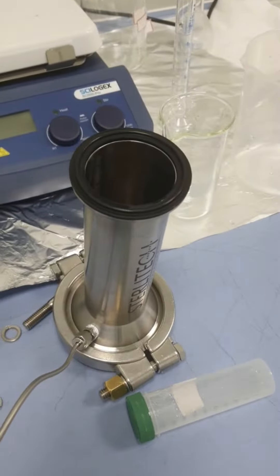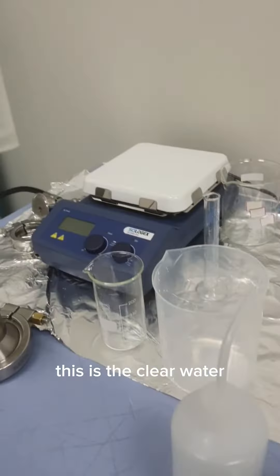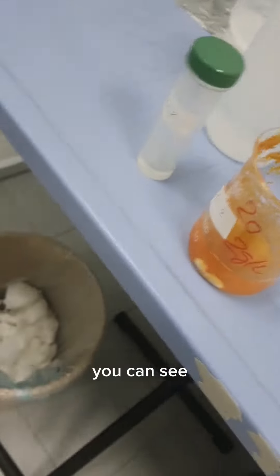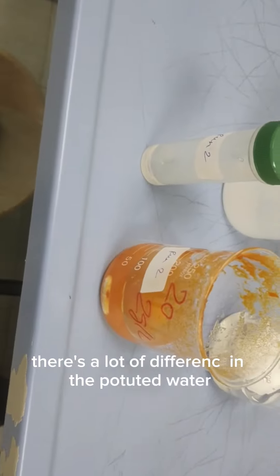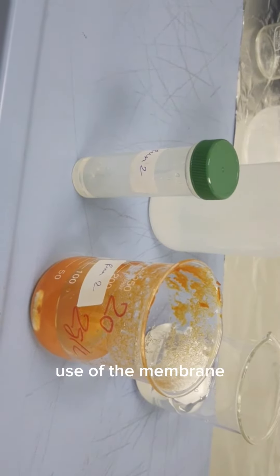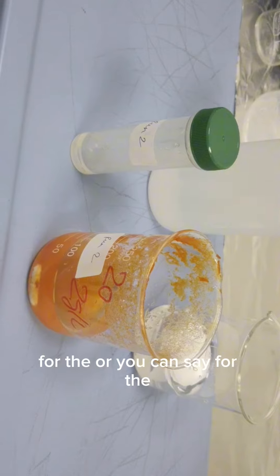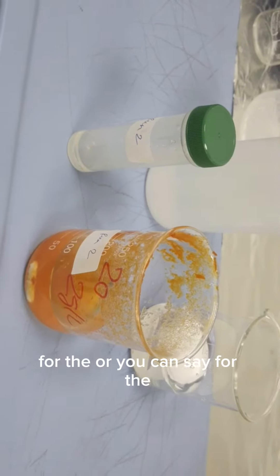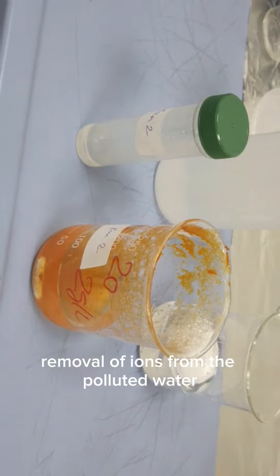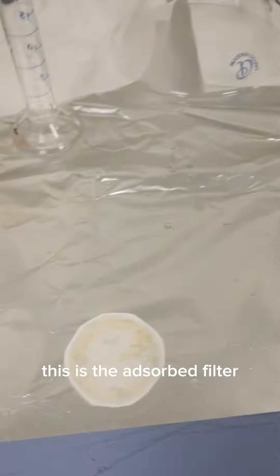The pressure is already released, and you can see the clear water here — this is the clear water. And this was our initial sample, so you can see there is a lot of difference between the polluted water and the treated water. This was the use of the membrane filter for the removal of ions from the polluted water.